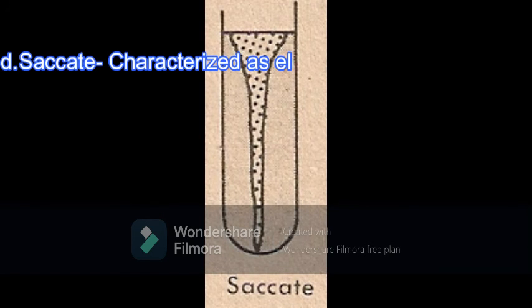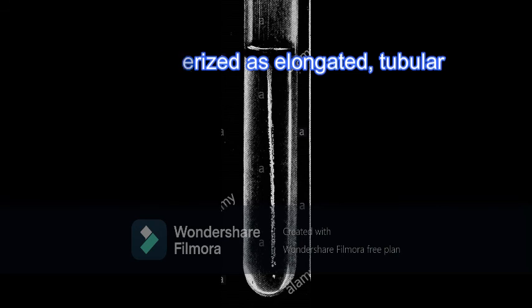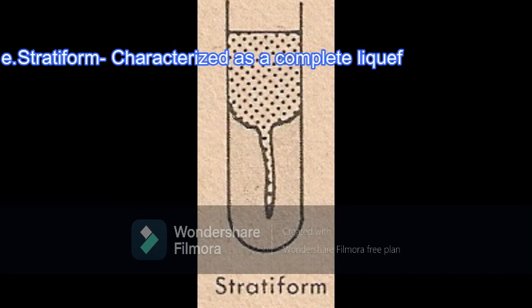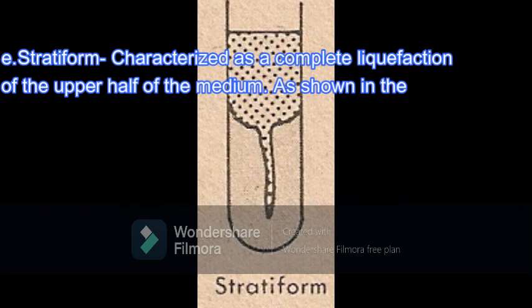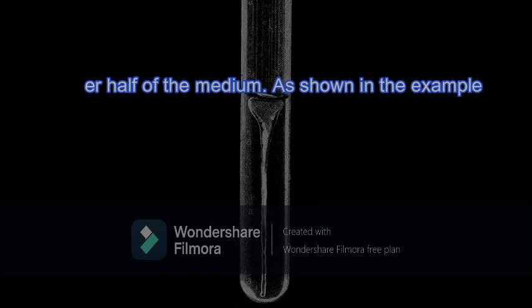The next form or pattern is characterized as elongated and tubular, stretching nearly all the way down to the bottom of the tube, and this is called saccate. And the last form or pattern is characterized as a complete liquefaction of the upper half of the medium, as shown in the example, and this is called stratiform.